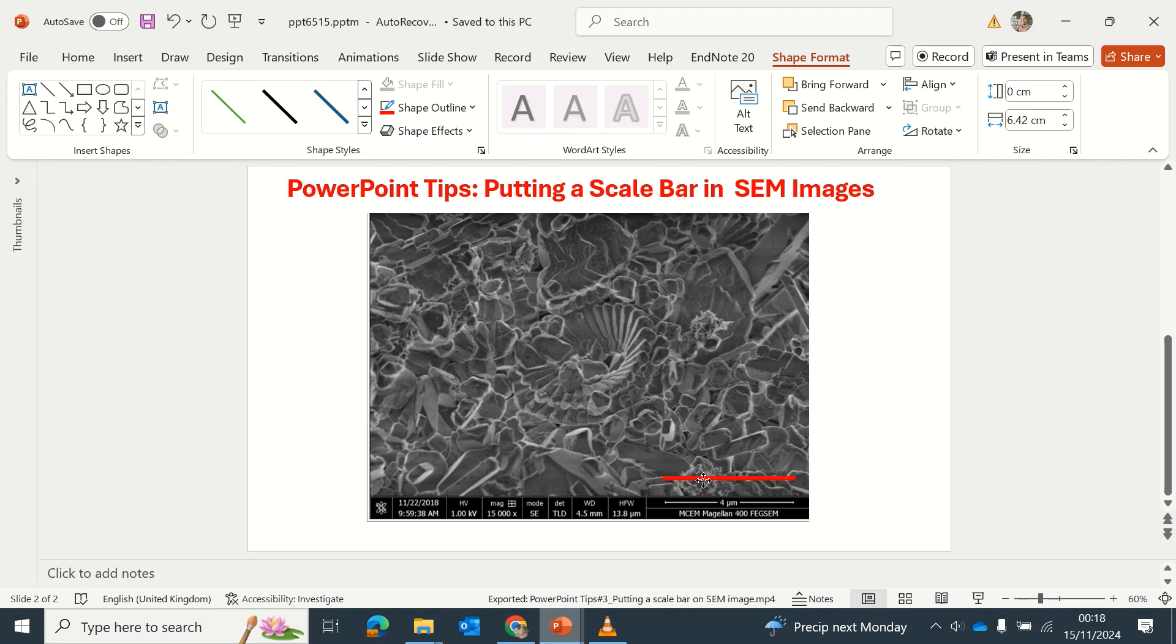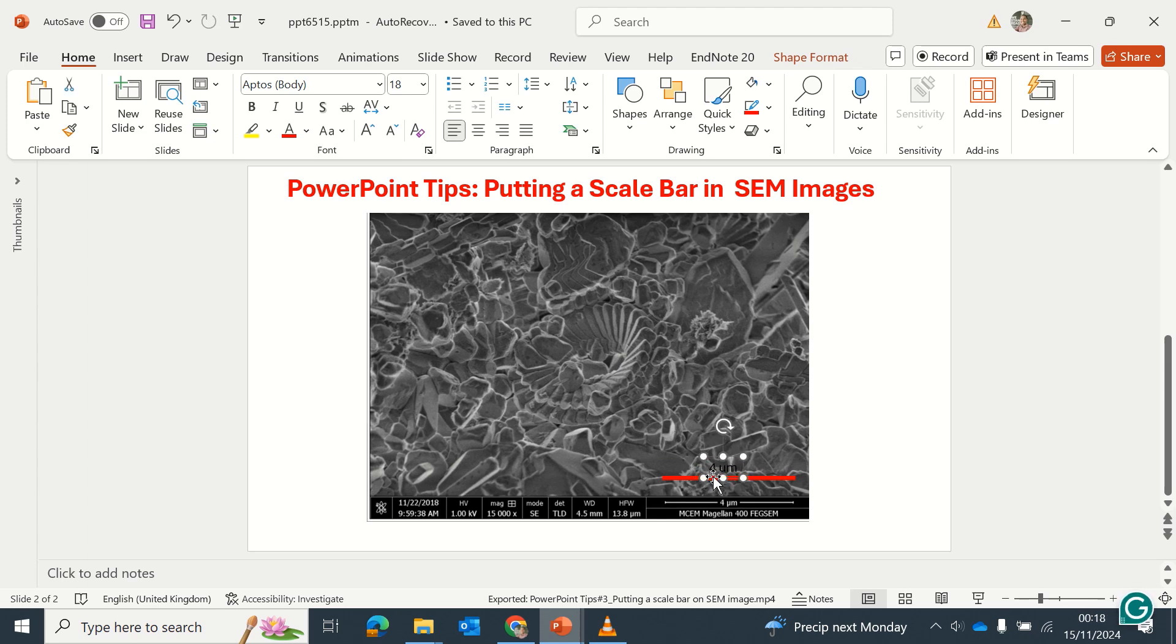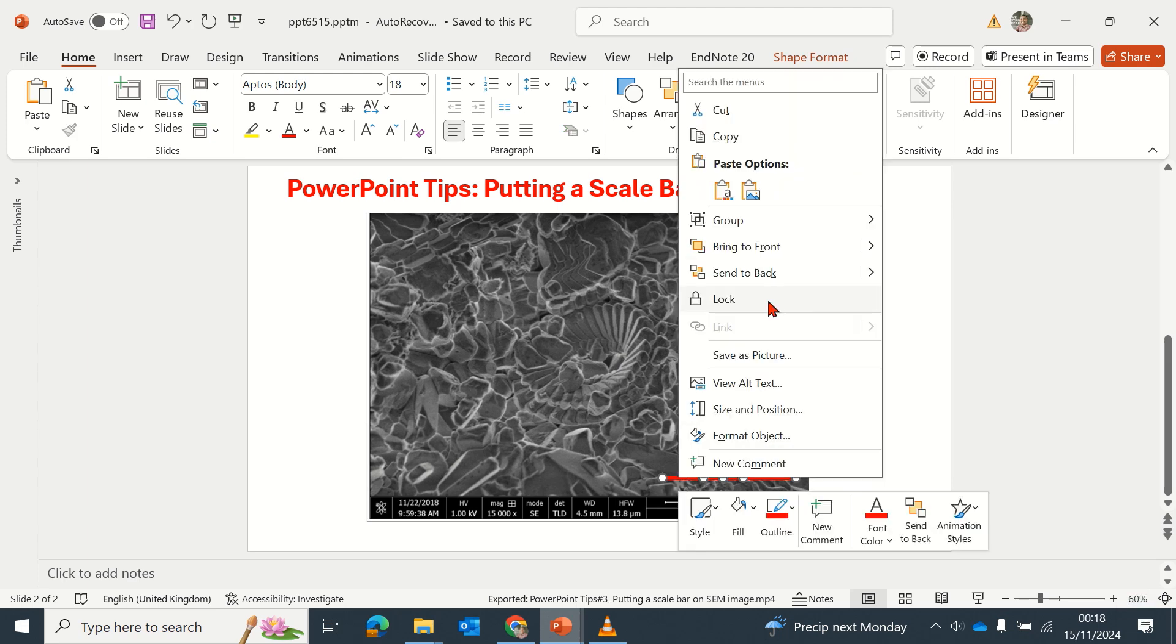Then you place it just above the section you are cropping and indicate the length of the scale bar, which is four micrometers in this case. Then you can group the scale and the value.